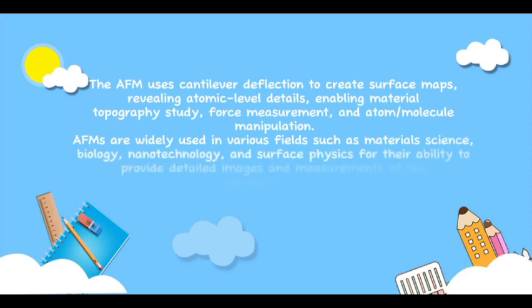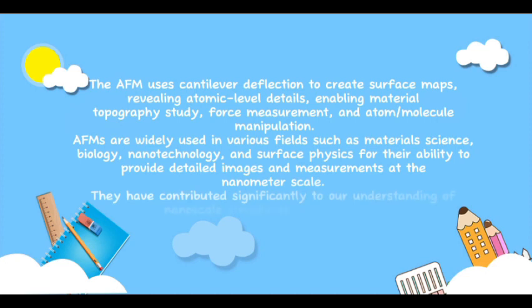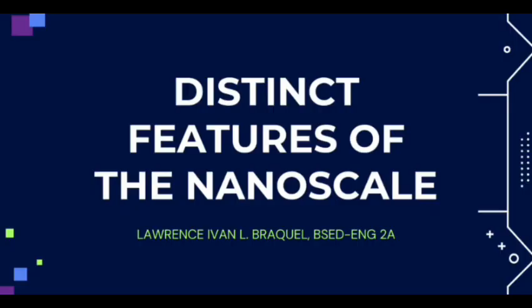AFMs are widely used in various fields such as materials science, biology, nanotechnology, and surface physics for their ability to provide detailed images and measurements at the nanometer scale. They have contributed significantly to our understanding of nanoscale structures and properties.